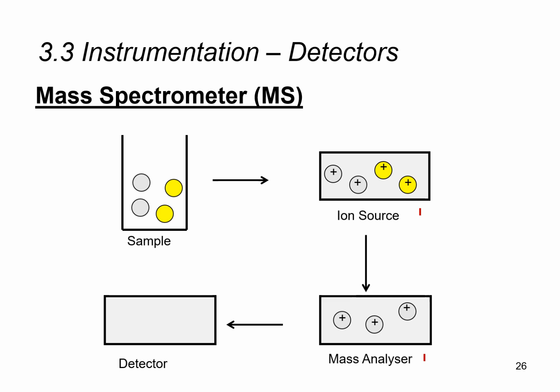So if in the beginning we tell the mass spectrometer that we are really only interested in ethanol molecules, ethanol has a particular molecular mass, so the mass spectrometer is capable of retaining only the ions with that molecular weight and filtering out the rest. Essentially all the detector does is count how many ions of this particular molecular weight we have.